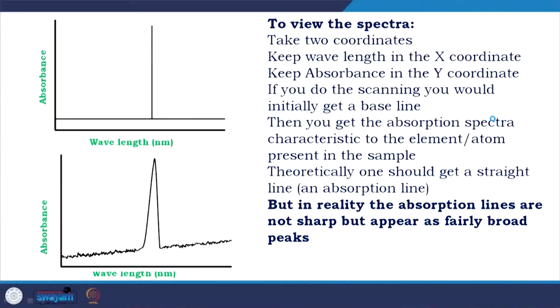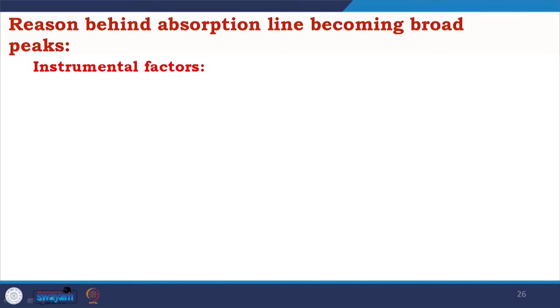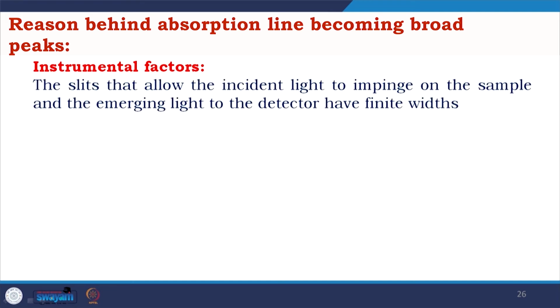Okay. So, this is in theory, this is what we get in practical. Why the absorption line giving broad peak? One, instrumental factor.